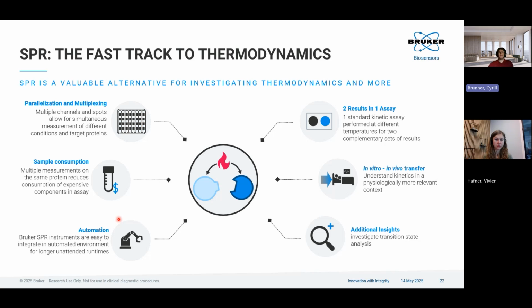So basically, with relatively little effort, you get hints that there might be differences between compounds binding to a protein, or antibodies binding to a protein, nanobodies binding to another protein, that can already help you early on. So when you have a higher amount of compounds early on, you can start to decide, hey, this is something that I need to look at, or actually I don't really see a difference, so it might not be that relevant.